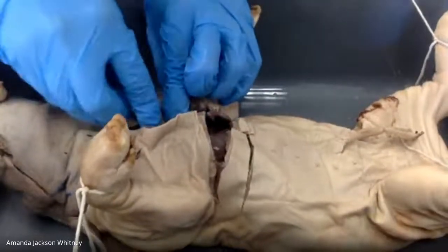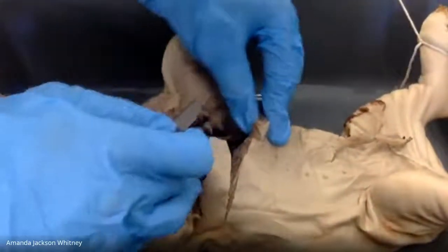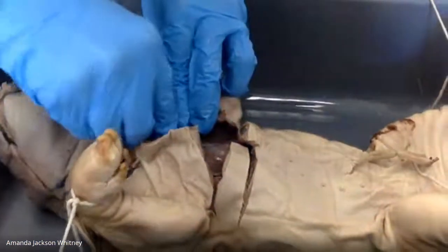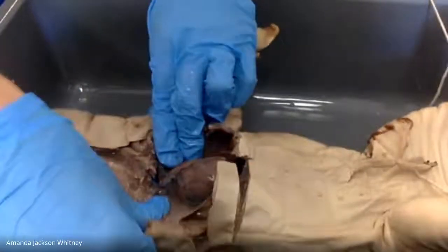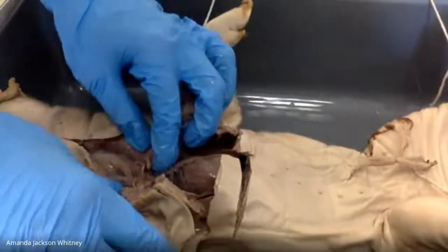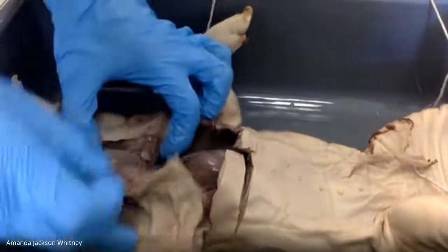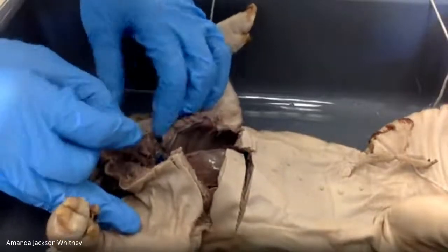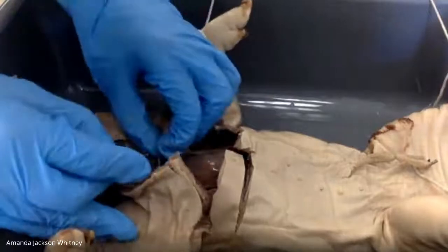And now we're going to try and get to some lungs, and then we'll start taking some stuff out of here. The more developed the pigs are, the tougher the bones are, as you might imagine, because they're more hardened. Remember that the bones go from cartilage to turning into bone over time with development.